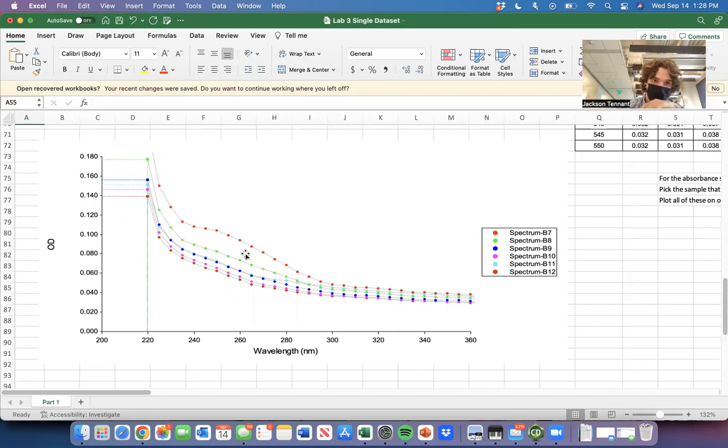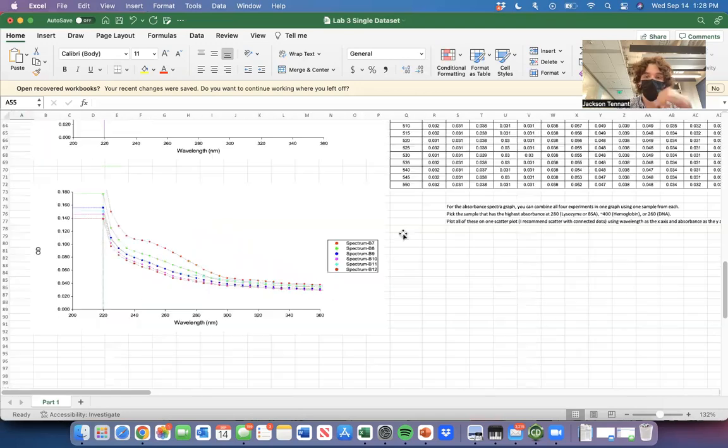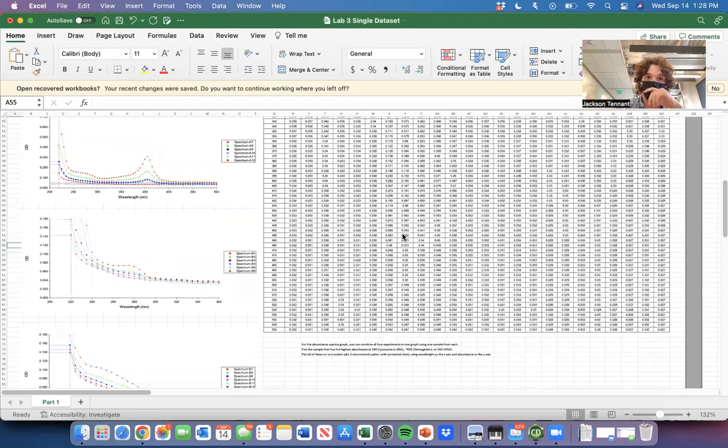But you can see here that, again, this is a poor-quality plate, but there's a good amount of absorbance at 260 nanometers. If this plate was truly UV transparent, you would see something more like that, peaking at 260 nanometers. Anyways, that is a little bit of the background of what we did in the first part.